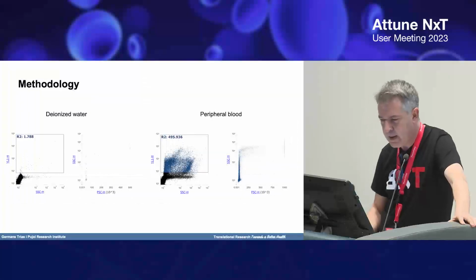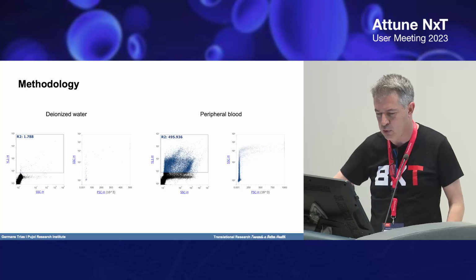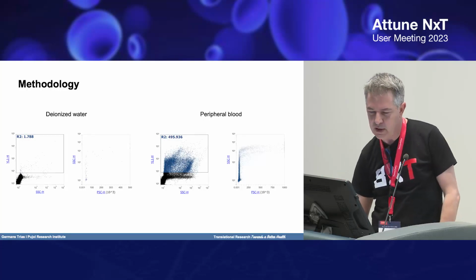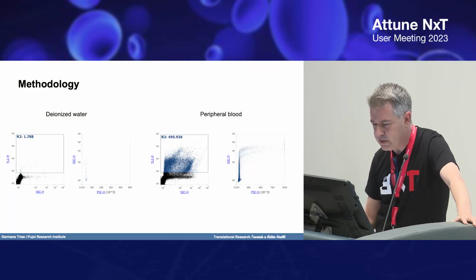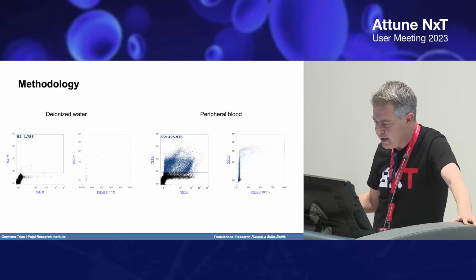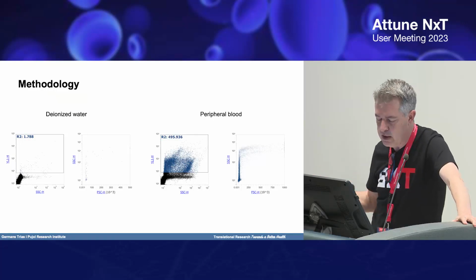We perform highly exhaustive controls daily. This is the accepted noise that we can obtain from filtered and deionized water, and we will always detect this presence of nanoplastics, because the tubing is plastic and the filters used are plastic too, so we will have a very good contamination.